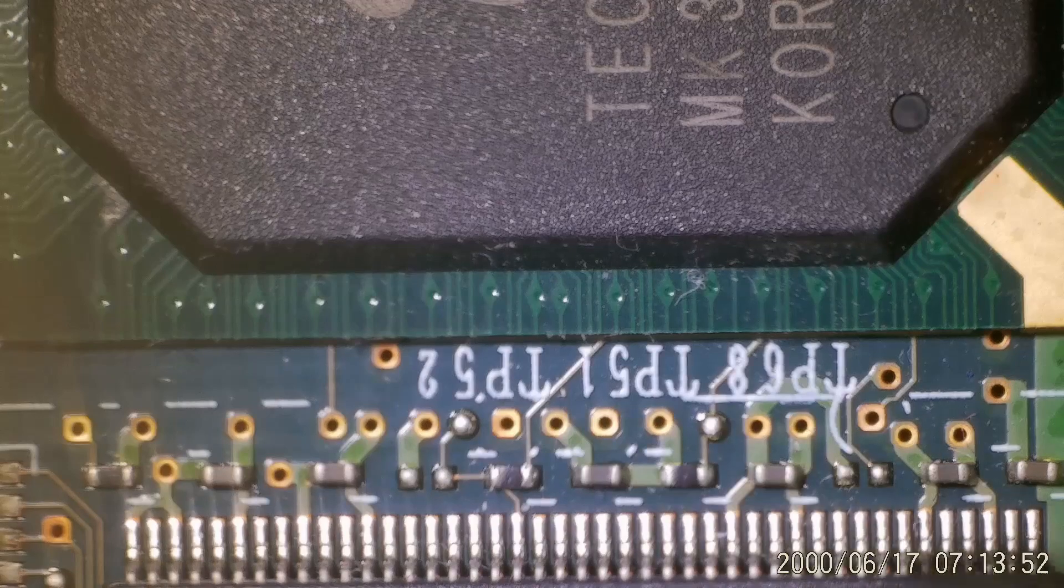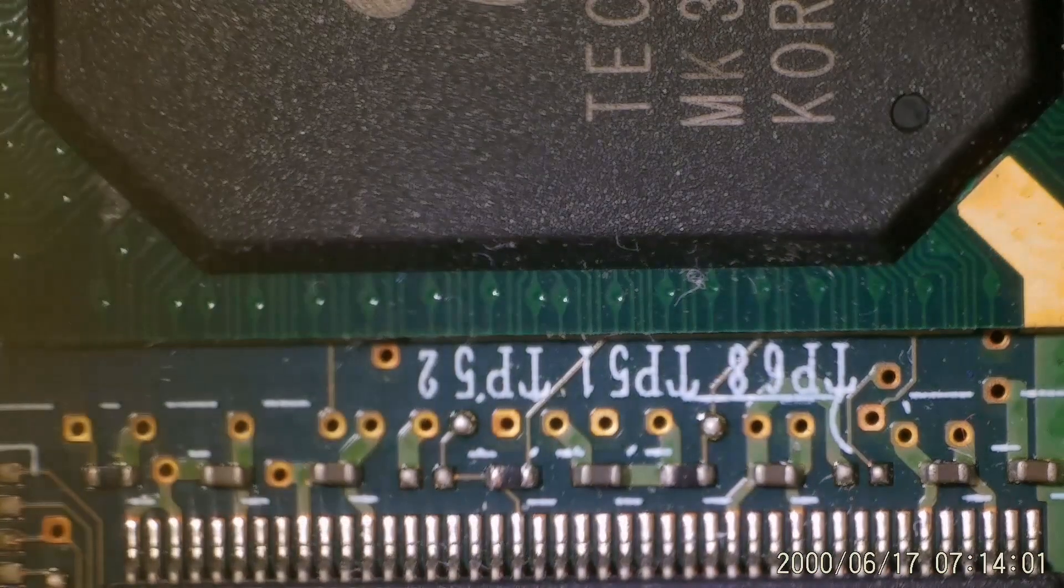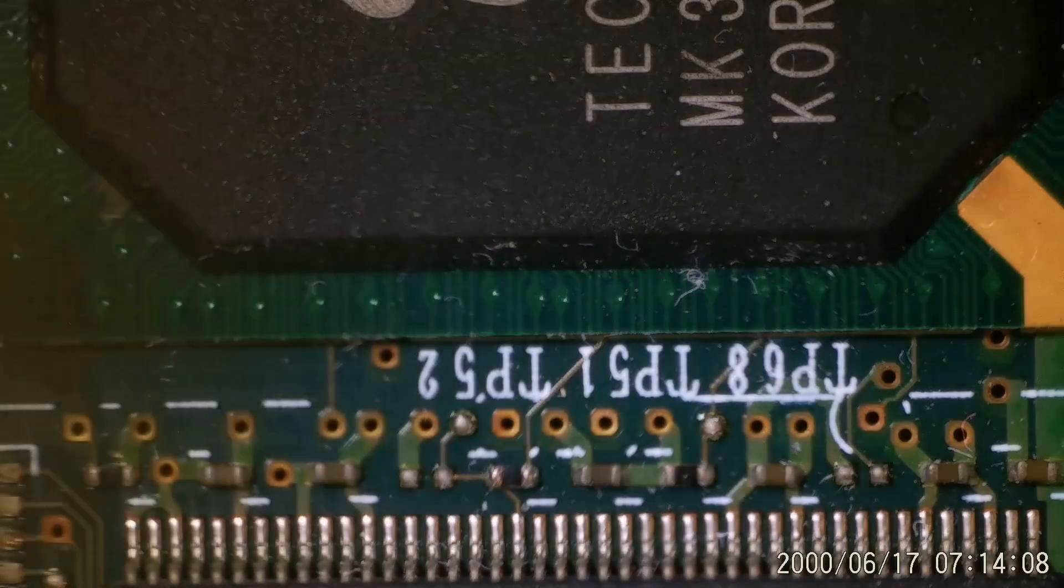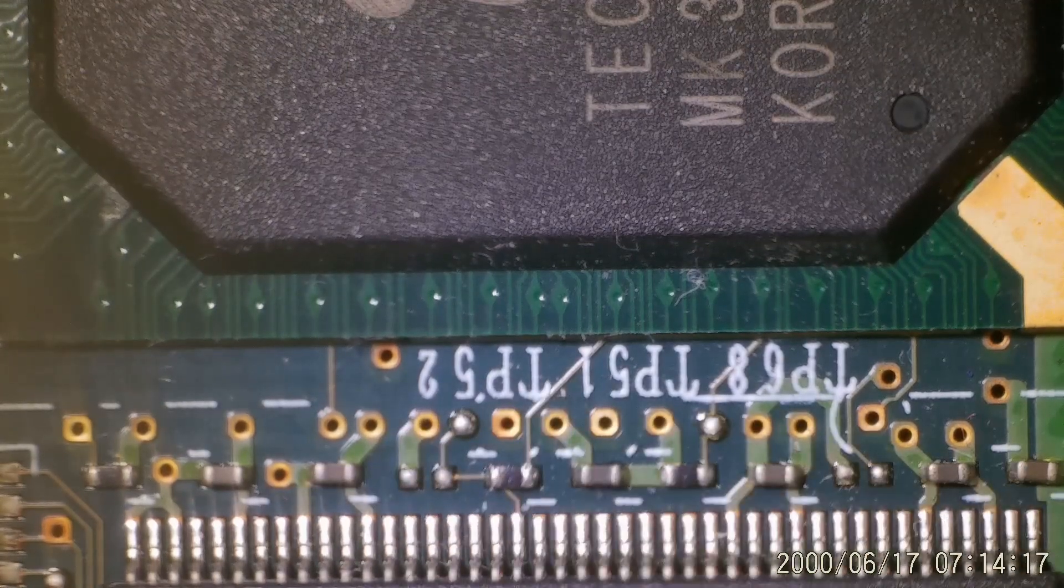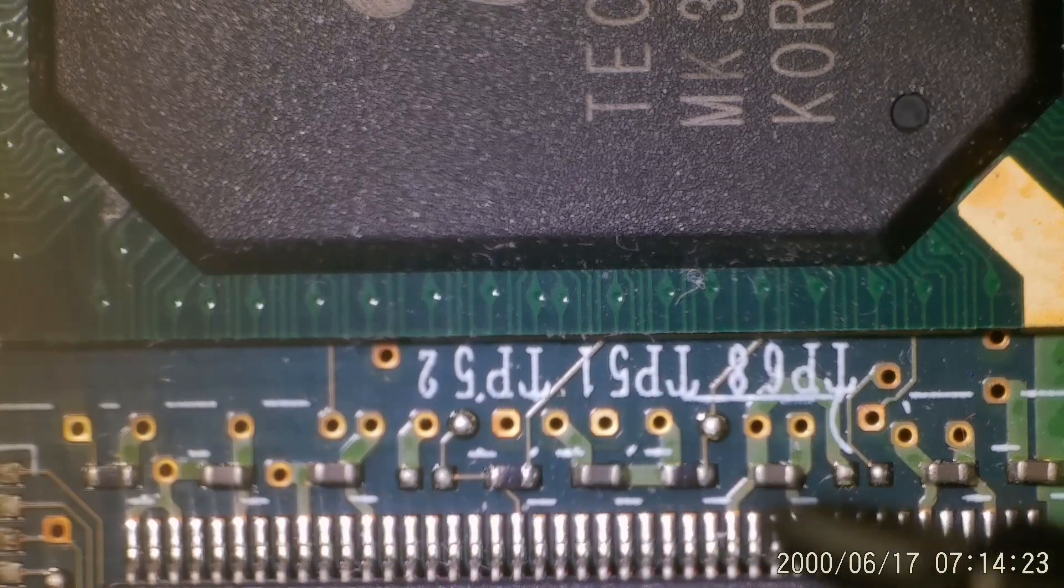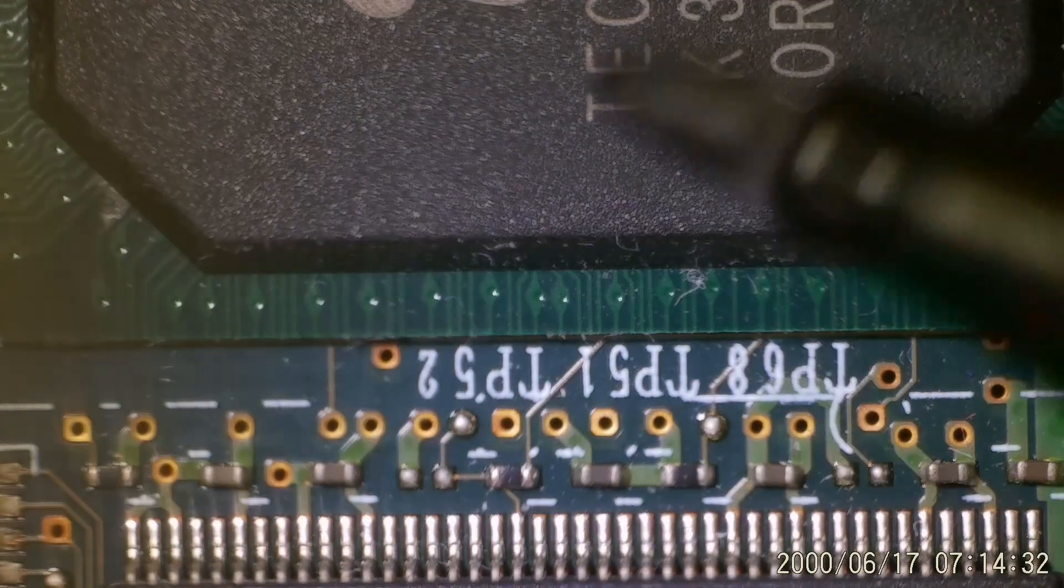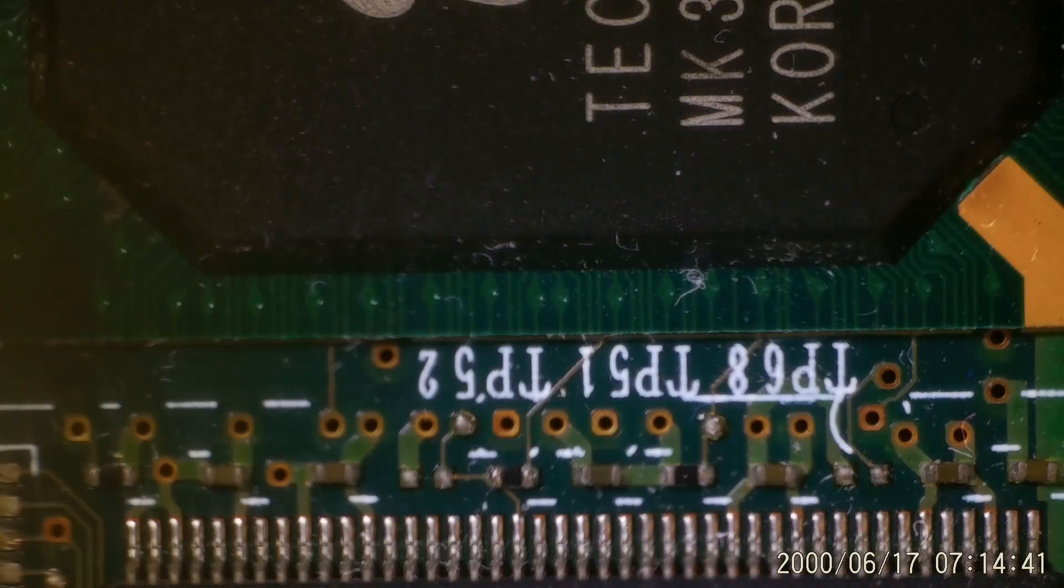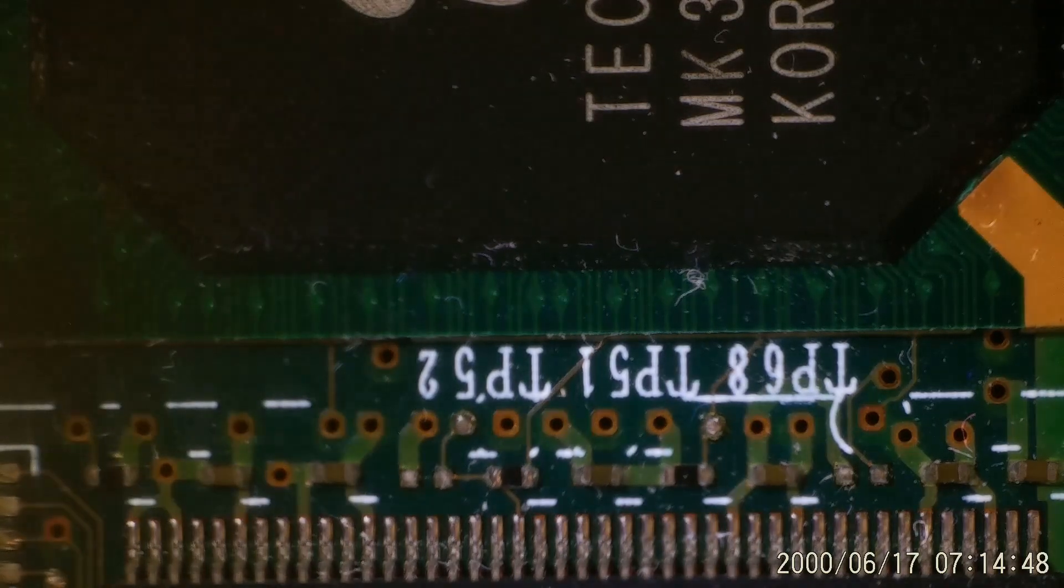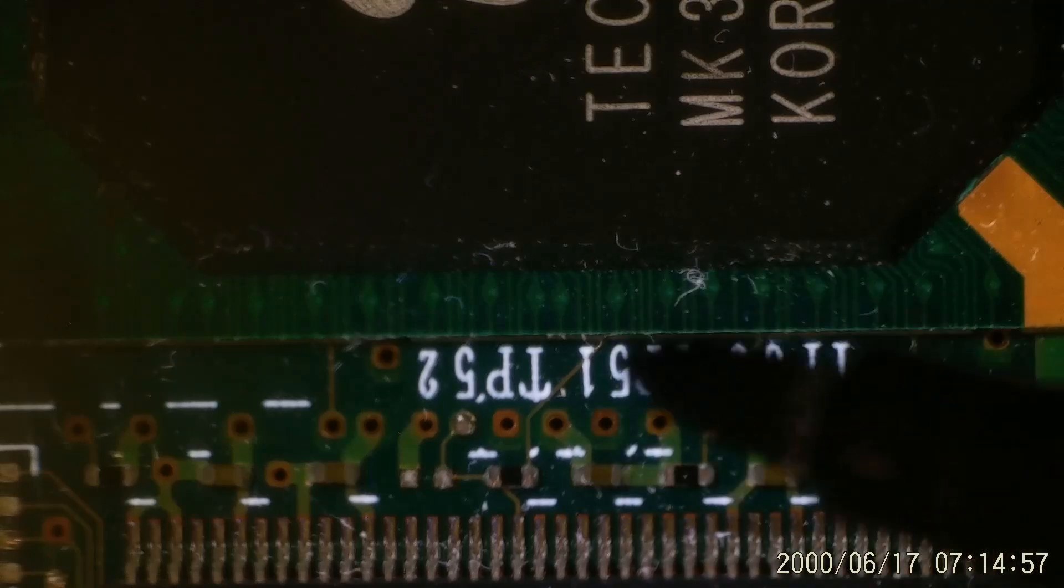There is, obviously, a difference here between the labels and the metallic parts. The labels don't seem to change much, but the metallic parts do. And I'm not quite sure, I have, we'll have to read up on that, but I think that the polarization of the light coming from our LED through the polarization filter is retained when it's reflected off these metallic surfaces. Well, obviously, that print stuff here destroys the polarization of the light. And so if I turn my polarization filter to a setting where it's basically 90 degrees off to the polarization filter on my objective.